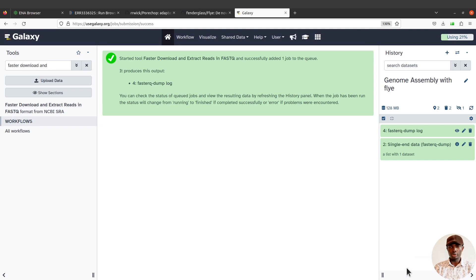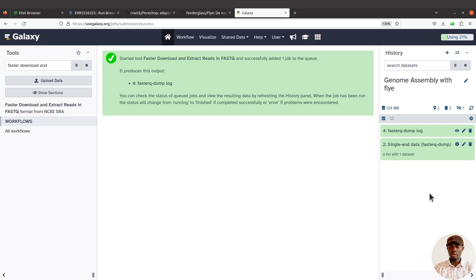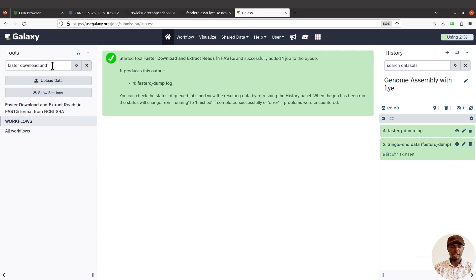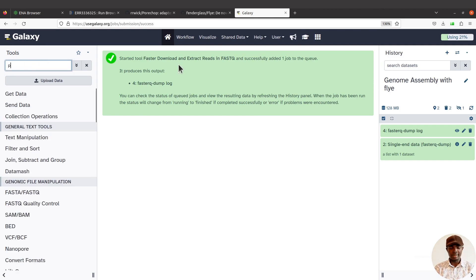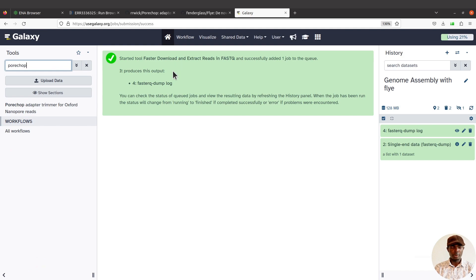Next, we are going to remove adapters — performing basic adapter trimming. Since this is Oxford Nanopore data, we are going to use the tool called Porechop. I've already covered the command line version of Porechop in another tutorial — check the description box for that video. Let's go back to the tools section, search for 'Porechop', and then use that for the adapter trimming.